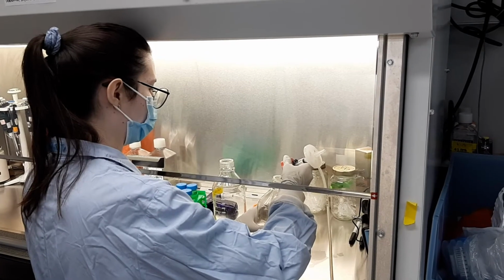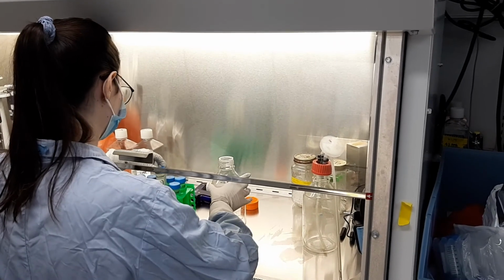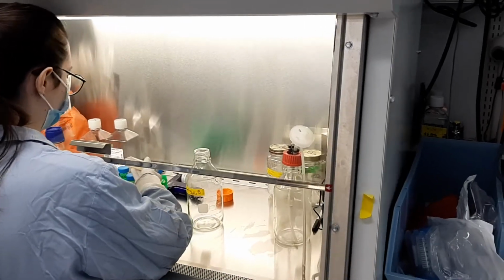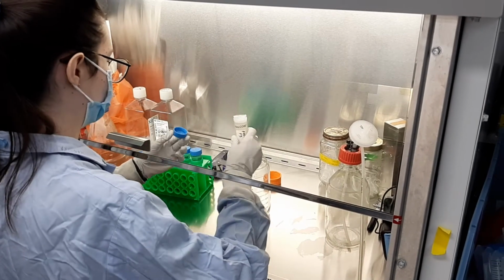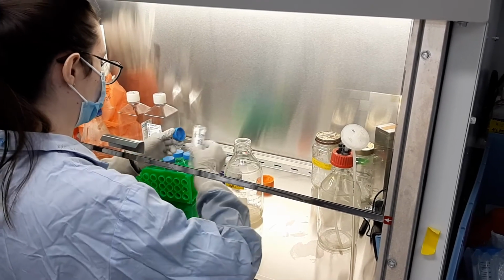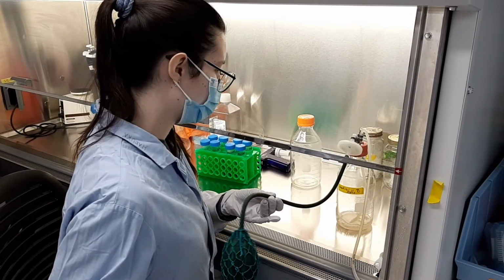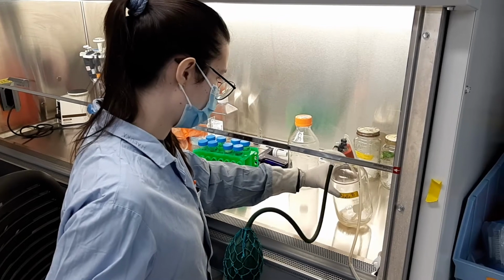Hi, I'm Julia, and I'm a master's student in the lab. I work on the vaccine production part. My project is focused on producing Newcastle disease virus, or NDV, as a viral vector for vaccines, including a vaccine against COVID-19. This virus is typically produced in chicken eggs, so my goal is to establish a production process using cell culture instead. For my project, I work on the upstream part of the process, which means I optimize the parameters to produce the virus, such as conditions for the cell growth and for infection.